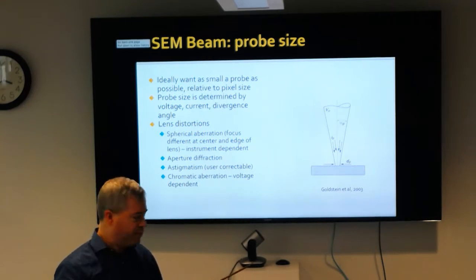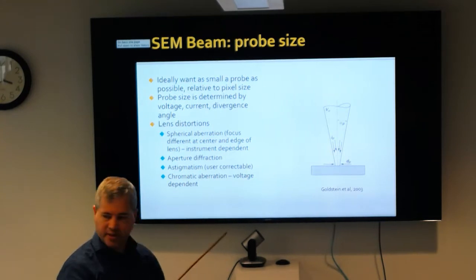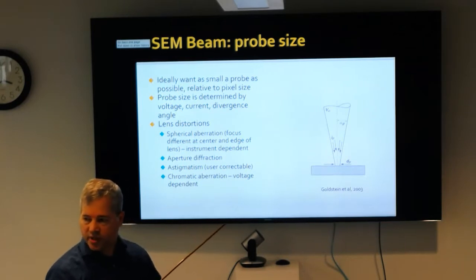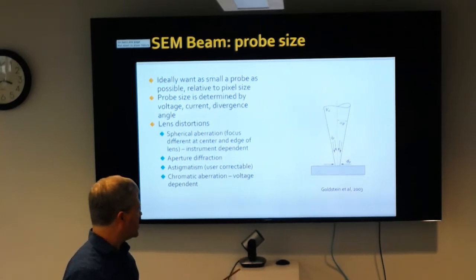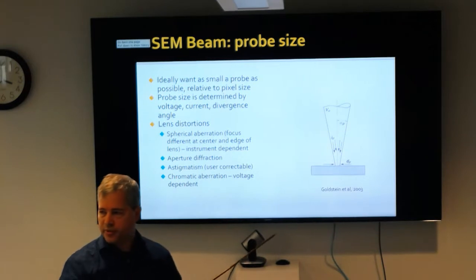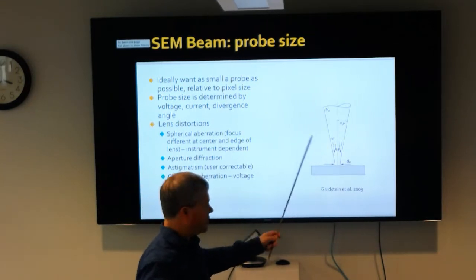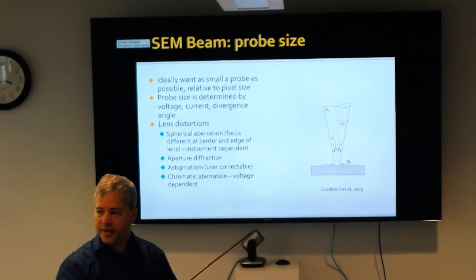Maybe, I mean, with the samples we look at, you can actually get, I'm sort of misspeaking, on an ideal sample, which is really well conducting and sort of perfect, you can get sub-nanometer resolution, maybe about 8 angstroms or something like that. But that's with a really well conducting sample. The samples we tend to look at are biological, so we coat them with platinum to make them conductive, but they're still not perfect, and so it's just never as good as TEM.